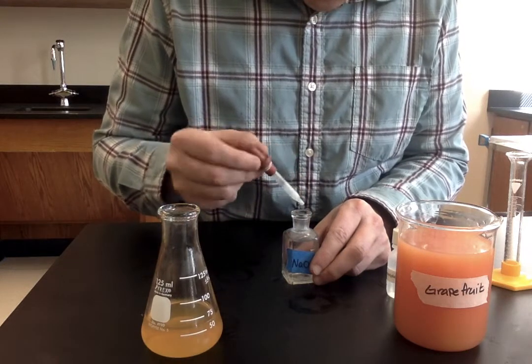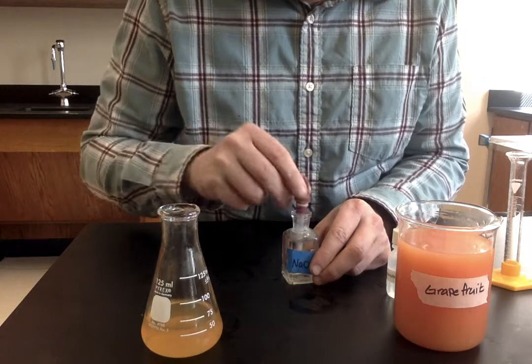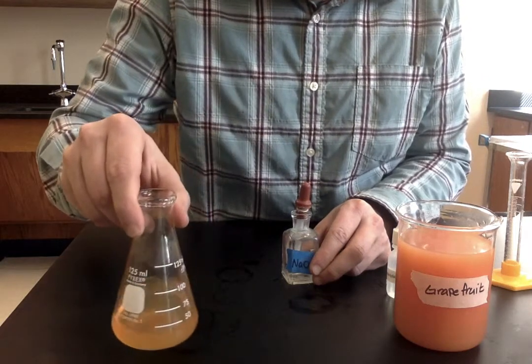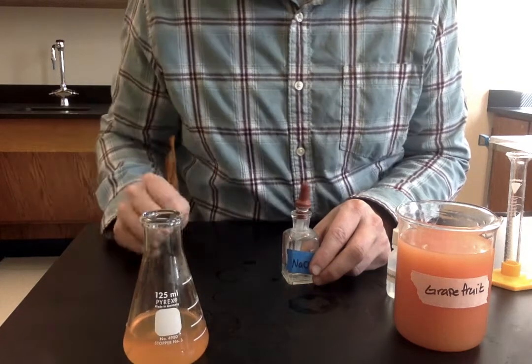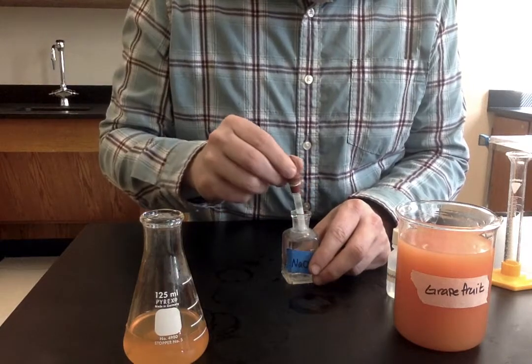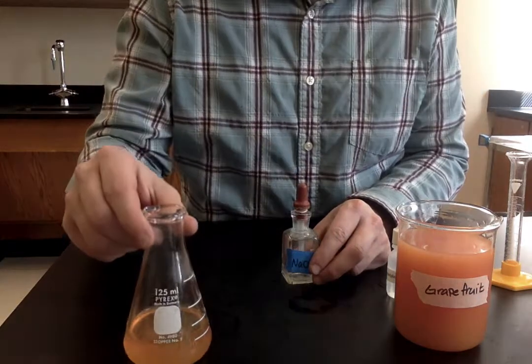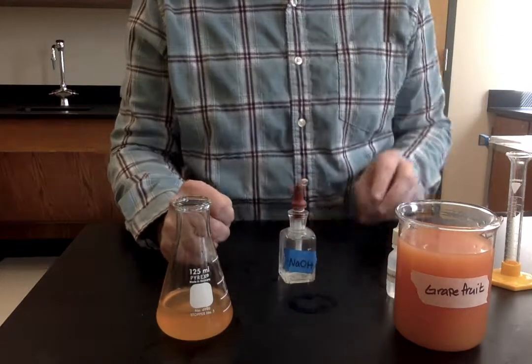Is that it? Let's try one more drop. I think that's the color change we were looking for. Count how many drops that was and go ahead and record it on your sheet.